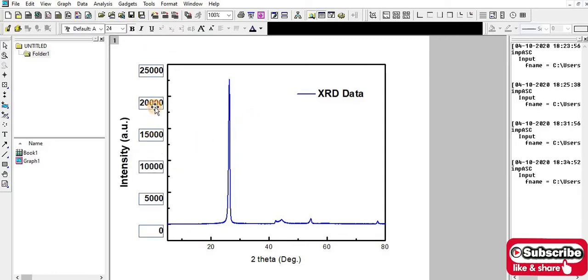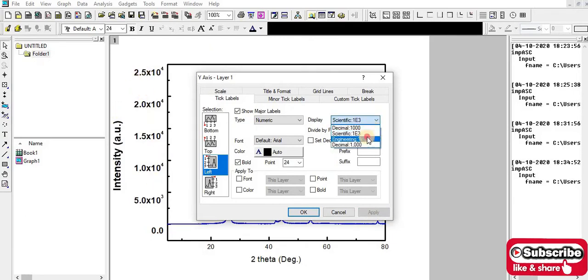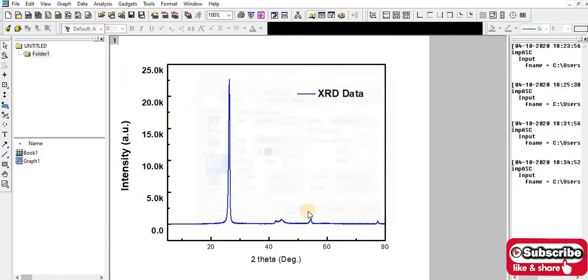And another thing, you can change this value to 25k, 20k, that way. So let's see. This is decimal, so if I want k or e to the power, it's okay. So in decimal, so in scientific, click, then apply. So this is scientific, the e to the power part. If I want to make it engineering, so 1k, this is the engineering part. So this is the process to change these things.